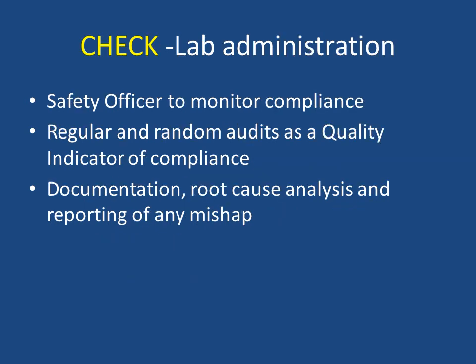Check. This is mainly the job of the laboratory administration. The safety officer and the supervisors should monitor compliance. Regular and random audits as a quality indicator of compliance should be put in place. Documentation of non-compliance, root cause analysis, and reporting of any mishap should be undertaken.